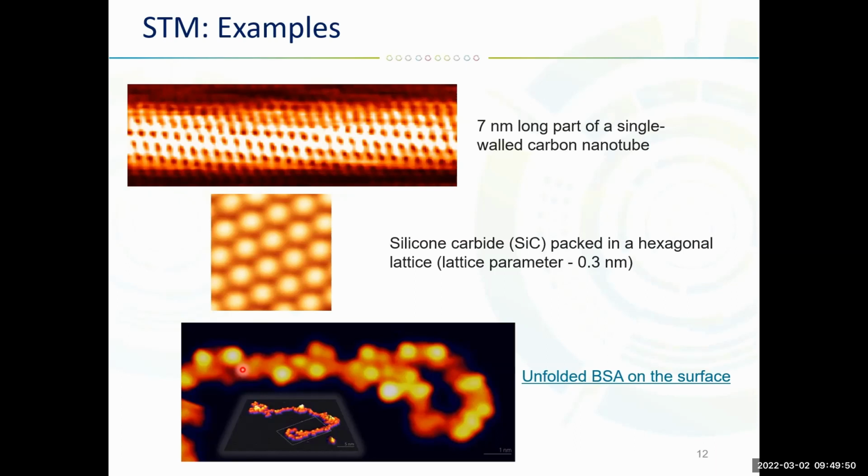So there are a whole bunch of experiments going on in this field. Some people even try to do folding in a vacuum, but again, it's quite difficult to perform. This kind of approach is usually referred to in the literature as single molecule force spectroscopy, and it's quite a powerful tool to study protein folding.